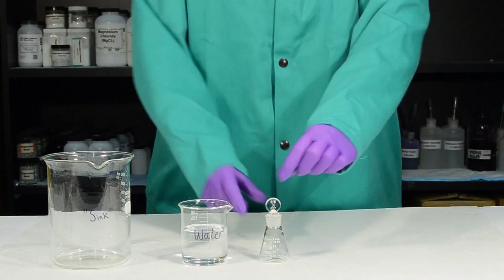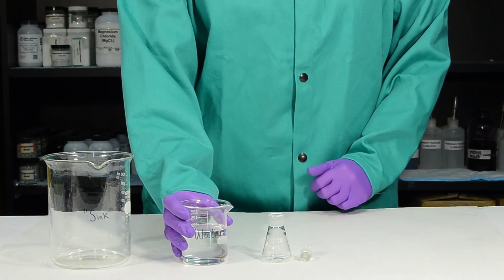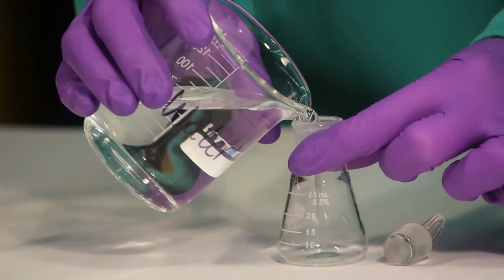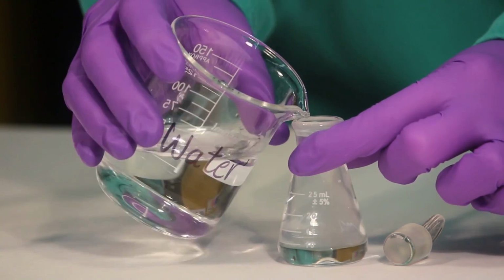After measuring the mass of the dry flask with the stopper, you must fill the flask completely with water. The same flask should be used for all your measurements. Begin by filling the flask up to the lip with deionized water.